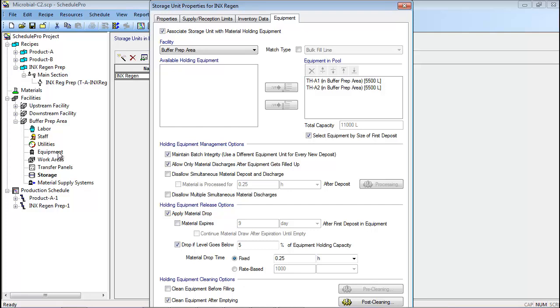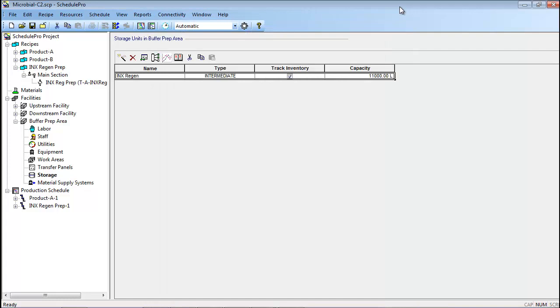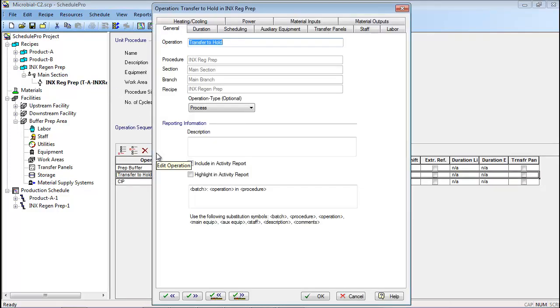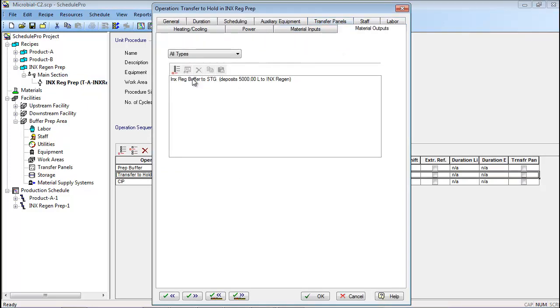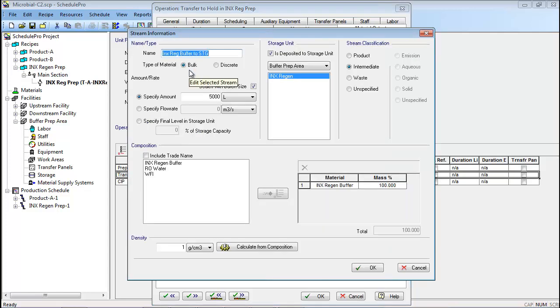As a result, the total storage capacity for this buffer is 11,000 liters. Finally, it was necessary to edit the recipes to ensure the appropriate amount of material would be produced or consumed by each batch. To specify an appropriate quantity of buffer generation per batch of the INX regen prep recipe, the transfer to hold operation within this recipe was edited. First, a new material output stream named INX regen buffer to STG was added to the material outputs tab of this operation. Then, the specifications for this stream were set by selecting the stream and clicking the edit button. Here, the composition and amount of the material can be specified, and the storage unit can be assigned. In this case, 5,000 liters of INX regen buffer will be produced and stored in the INX regen storage unit.